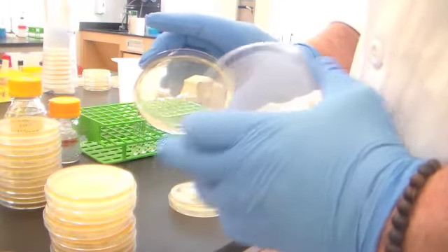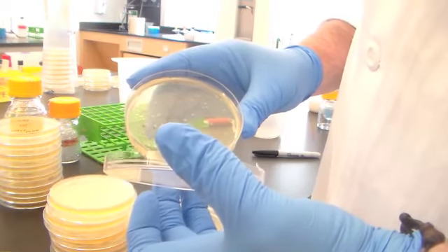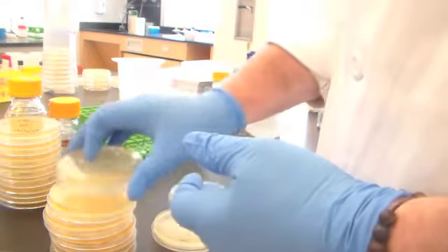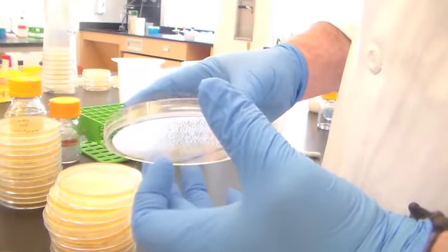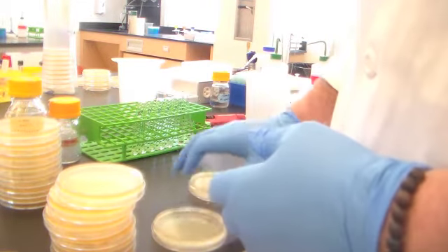So I wouldn't be able to trust that result as much as if I were counting 25 or 30 or 50 colonies, because then a minor pipetting error wouldn't have a major effect on my calculations. And then at 10 to the minus 8, the plate has no colonies. So we've eventually diluted out beyond where the culture is.